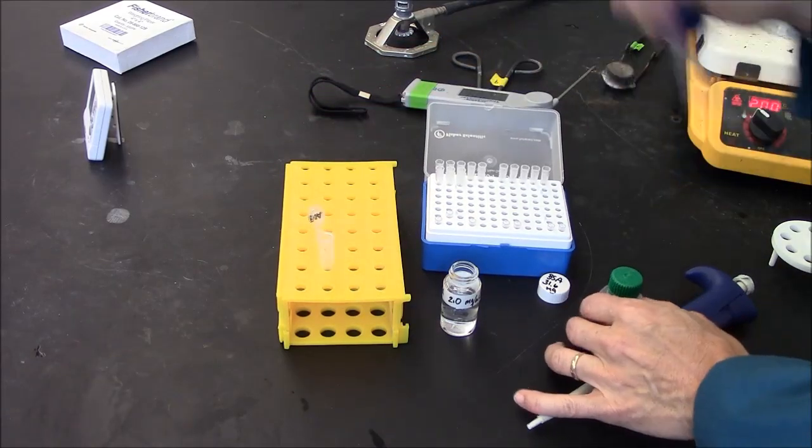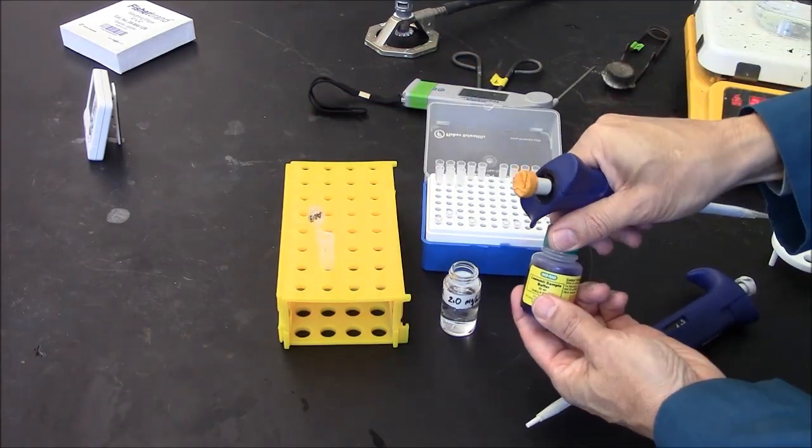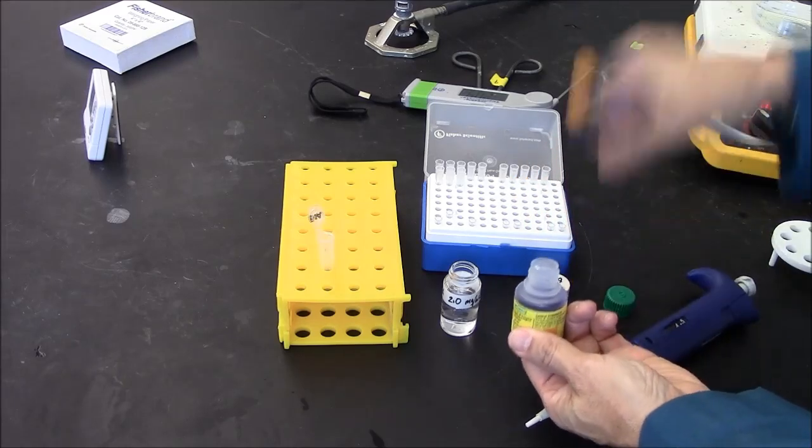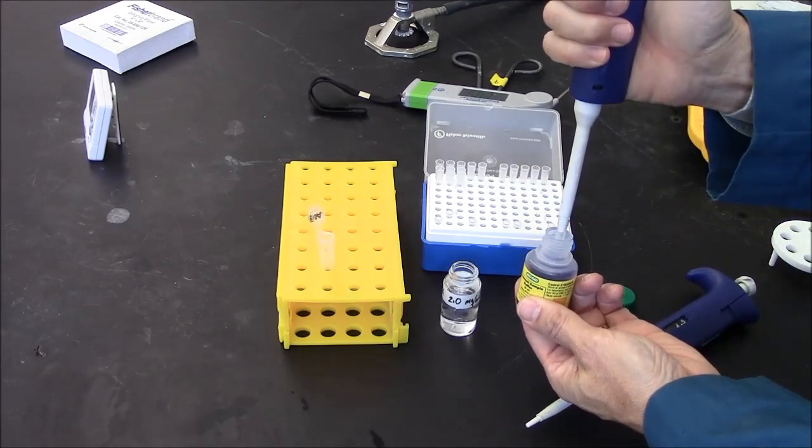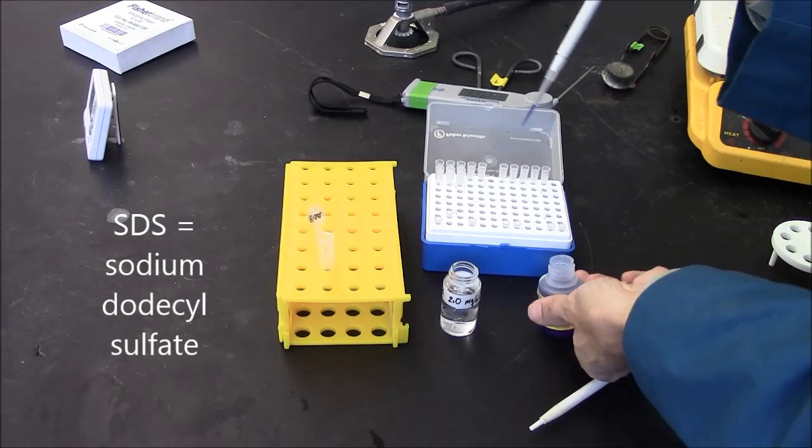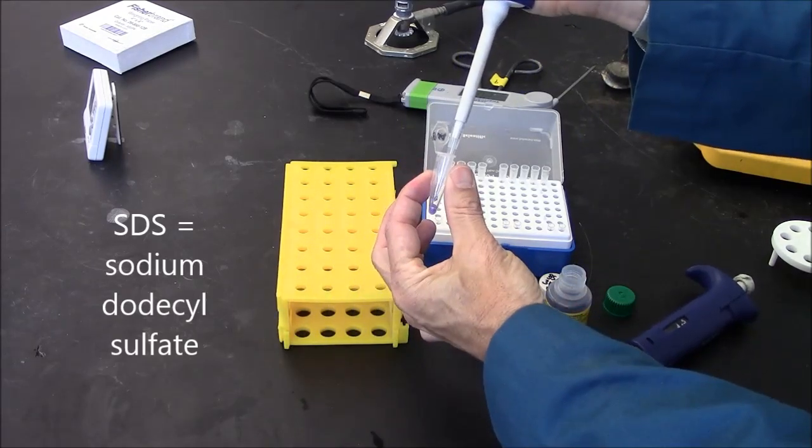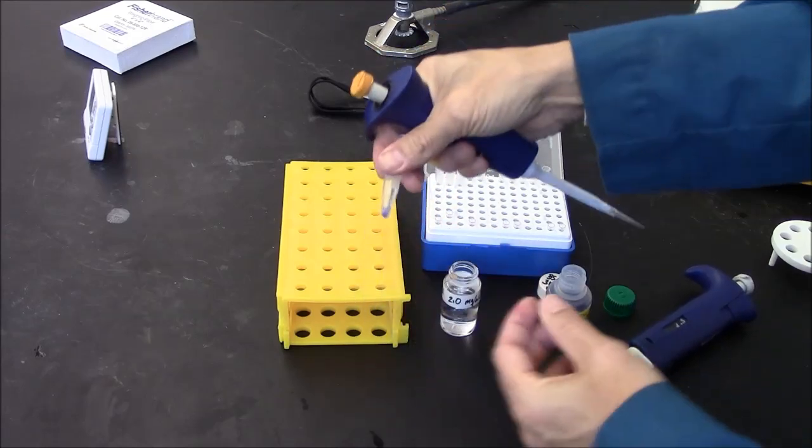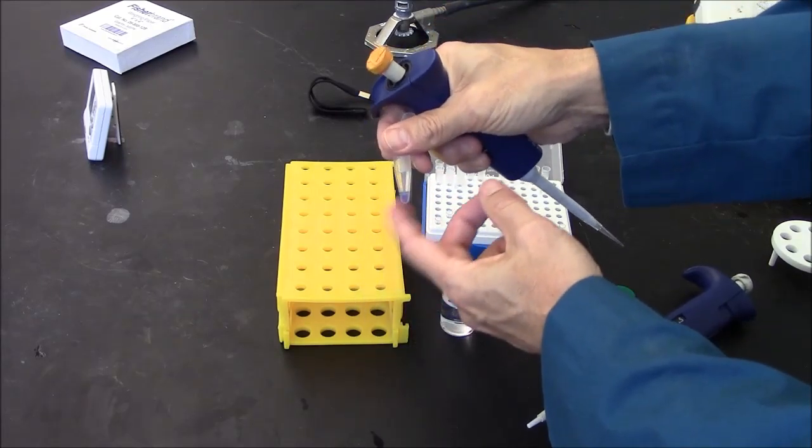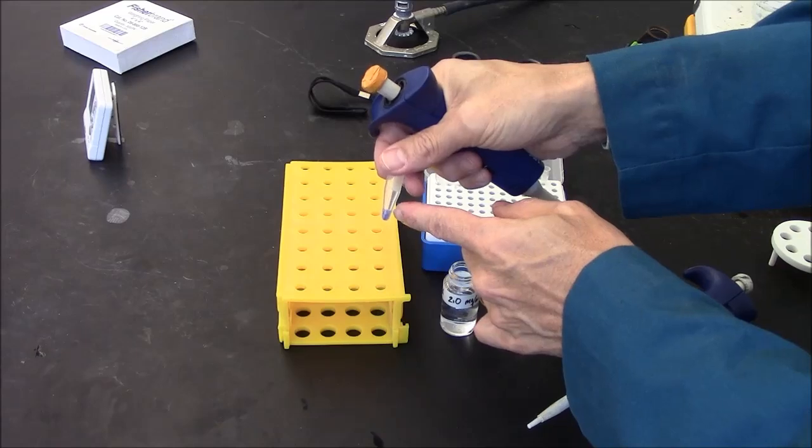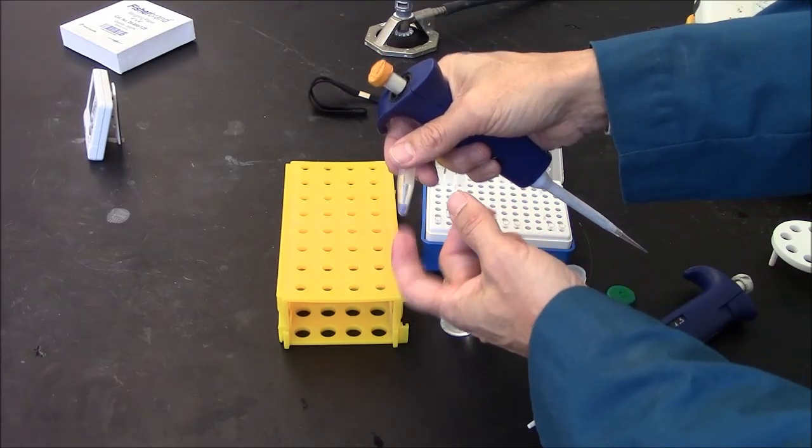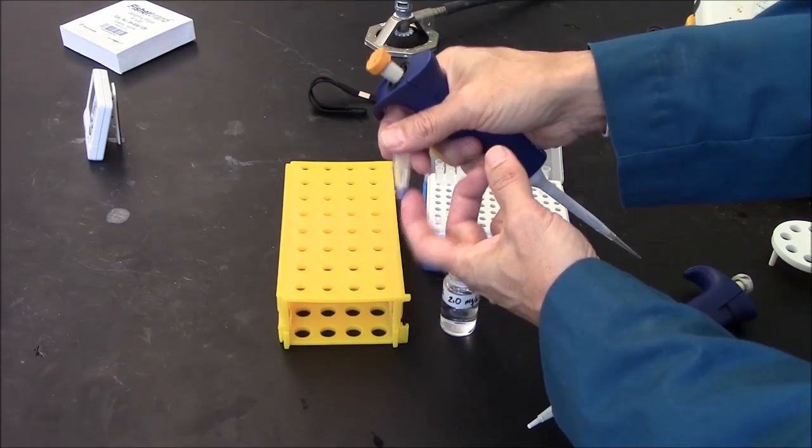Then I need 25 microliters of this purple Lemely sample buffer containing SDS to denature the proteins. That is actually dense, the purple is dense. You'll get some foam here because it has detergent. SDS is a detergent. I'm just gently agitating that.